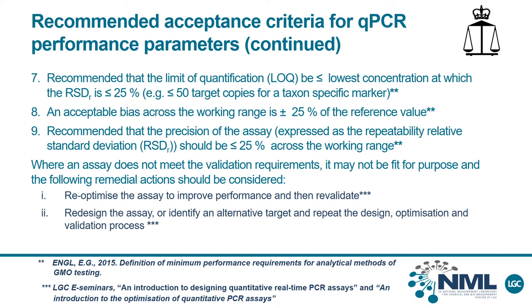Alternatively, redesign the assay or identify an alternative target and repeat the process of assay design, performance optimization and validation. Further information on the design of real-time PCR assays, as well as the optimization of quantitative PCR assay performance, may be found in the previous LGC seminars indicated on the slide.